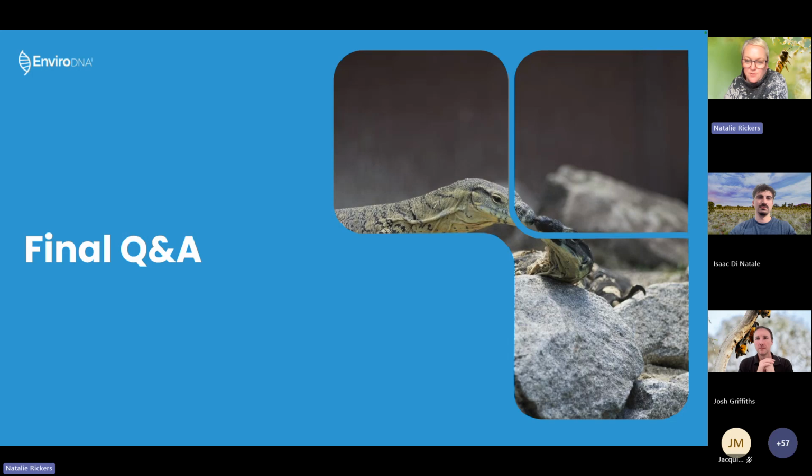How effective is passive versus active eDNA sampling for flying insect DNA? So that trial that Isaac mentioned directly compared passive and active samplers. We didn't specifically pull out flying insect DNA, but in terms of overall diversity and particularly focused on mammals, birds, and plants, I think that project was.